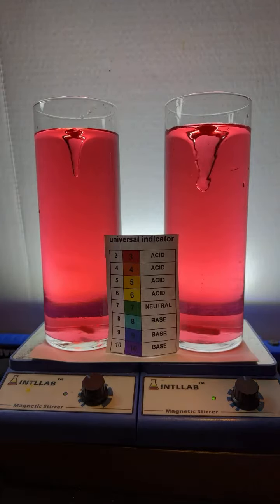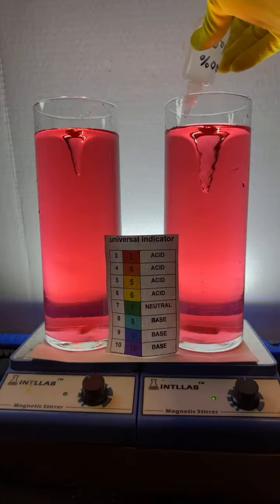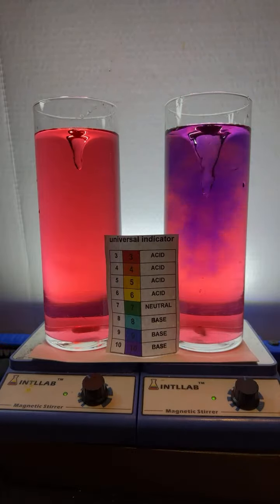The base I'm adding is sodium hydroxide. We're going to do 1 drop over here on the right for Zachariah. You can see me get that green.